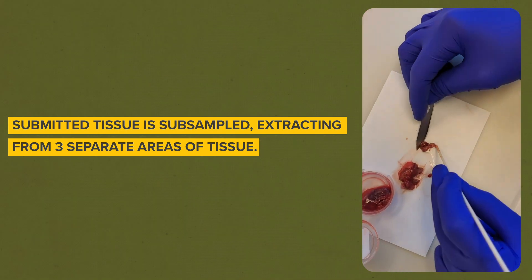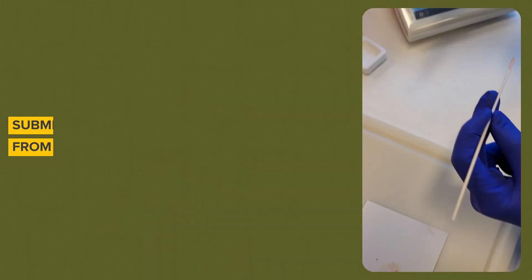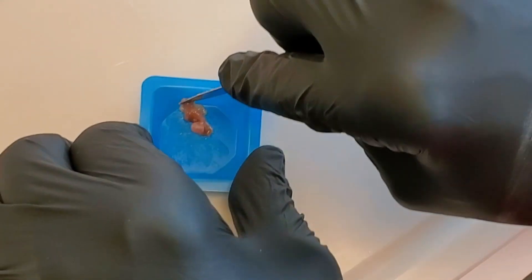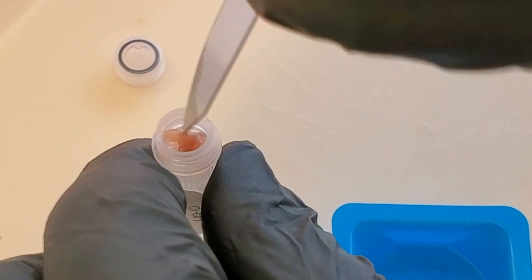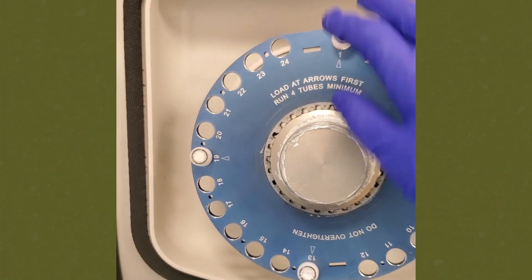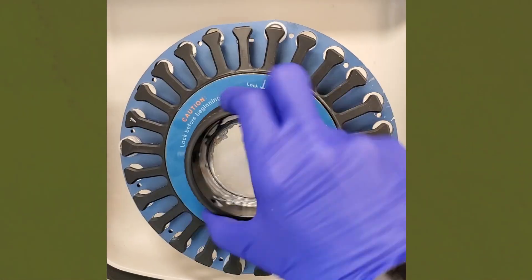We sub-sample the tissue, extracting from three separate areas of the submitted tissue. Next, we weigh the sample, chop it up, and put it in a grinding tube. The sample in the grinding tube is homogenized to make a lymph node smoothie.